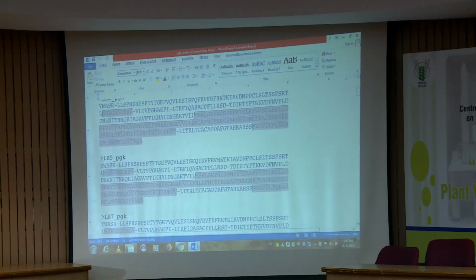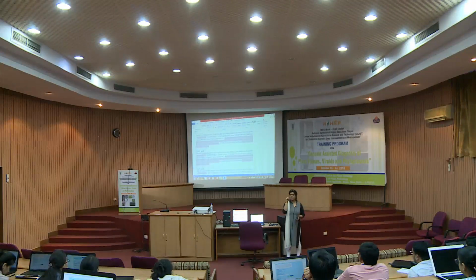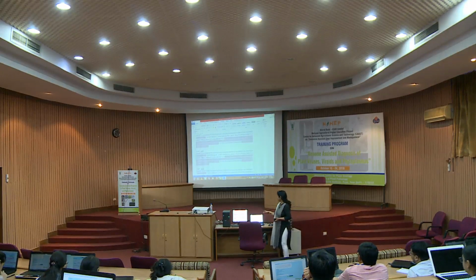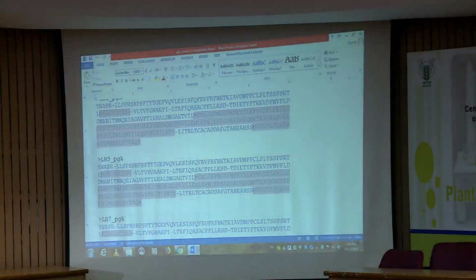So, what will happen when you put this in the preparation of flat files, you have to mention the coordinates of the coding region. If you see some sequence in NCBI, I can show you how it looks. In the coordinates and the complements, it will show you figures from like 1 to 10, then again that greater than or equal to sign. I will show you how it looks. So, this protein file also should be ready before that flat file preparation.